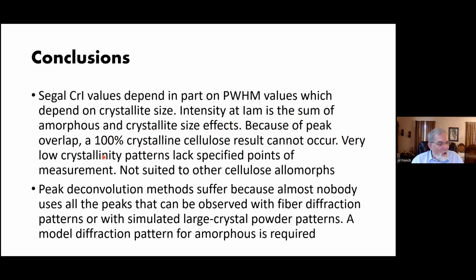And for the very low crystallinity patterns, you might want to say, what does a 10% amorphous or 20% amorphous pattern look like? Well, there's no minimum in between the 110 and the 200 peaks at 18.6. It's just another point on a sloping curve, and that's really not a specified point of the measurement for the amorphous component.